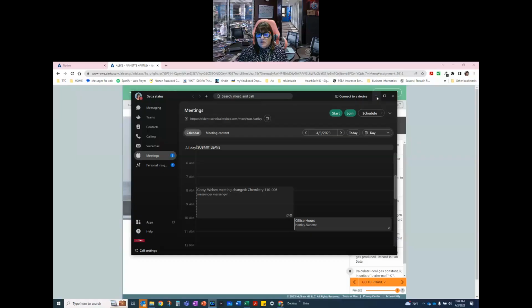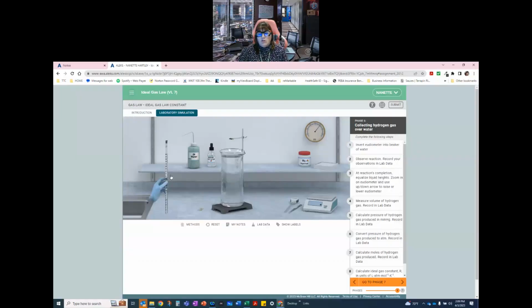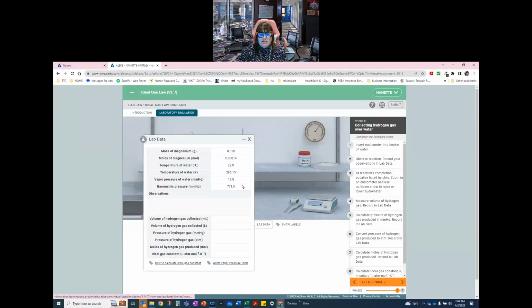I want to show you one particular part of this to make sure that we're clear on what needs to happen. I have already come in here and answered some questions and gotten this set up, and I have some data that I have collected. So I calculated the mass of magnesium, the moles of magnesium, the temperature of water, the temperature of the water in Kelvin, the vapor pressure of the water, and the barometric pressure. And I've got the eudiometer all set up, so it's ready to go.